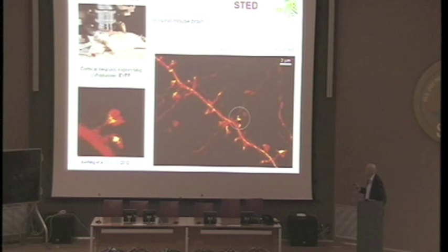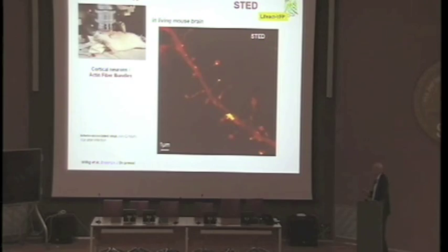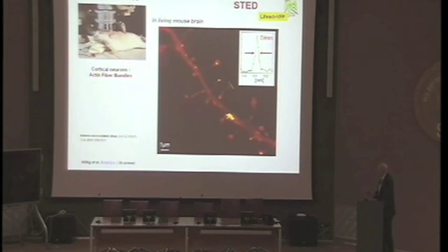This is over a period of minutes, so to speak. Now this is just cytosolically labeled. Again, the resolution is substantially higher than what you normally have. So we have tried also looking at actin in the fiber bundles. This is work that comes out soon. So it works. It gets you down to high spatial resolution. The level of detail that you have here is not bad.